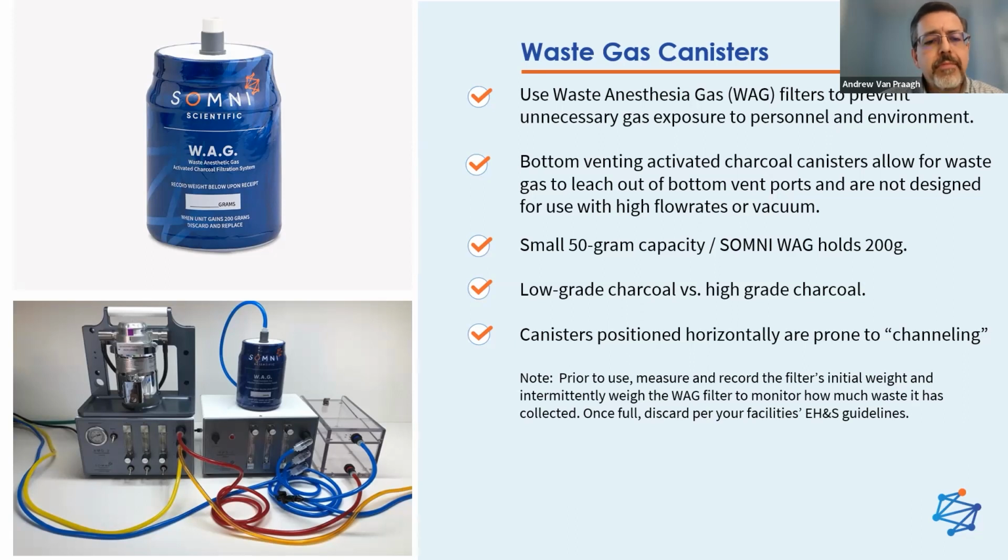The additional thing that's neat about the setup here is it's all color coded. Typically the way you would do the install is that you would have the supply side with the red line going to the induction chamber. The orange line would go to any kind of desktop or lab bench units that you're going to be using, single mouse, multiple mouse nose cone. And the third yellow line that you can see there heading off to the left, in our case, being from SI Imaging and using optical imagers, would go to the imaging station.